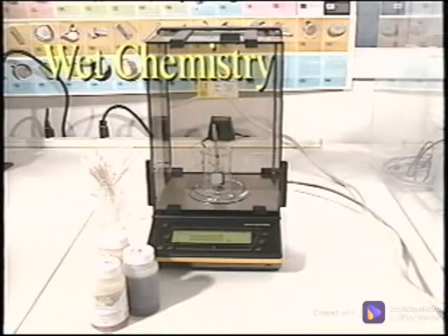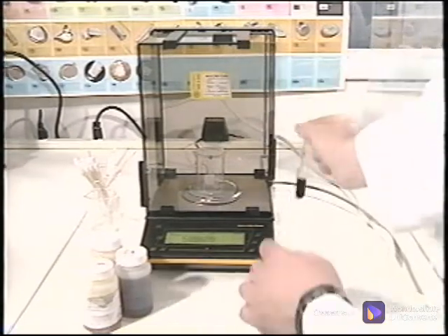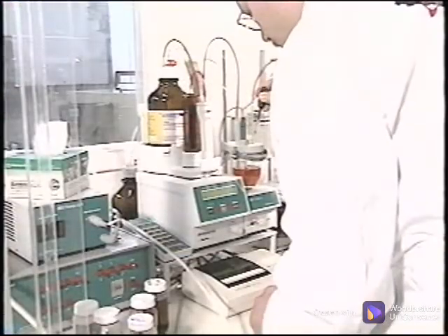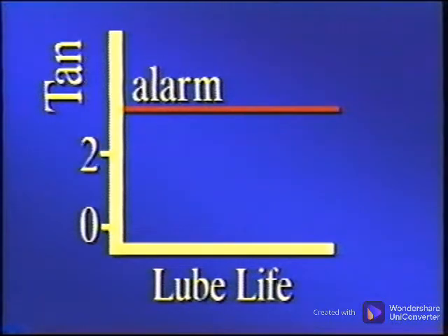square millimeter. The wet chemistry automated workstation measures the total acid number and gives a precise measure of water in the oil using the Karl-Fischer test. It is used when the FTIR analysis indicates oil degradation or that water is present. The TAN of a new lubricant should be 0.0 to 2.0. An increase in acidity by 2 points or 50% indicates there is a real problem with acidity.